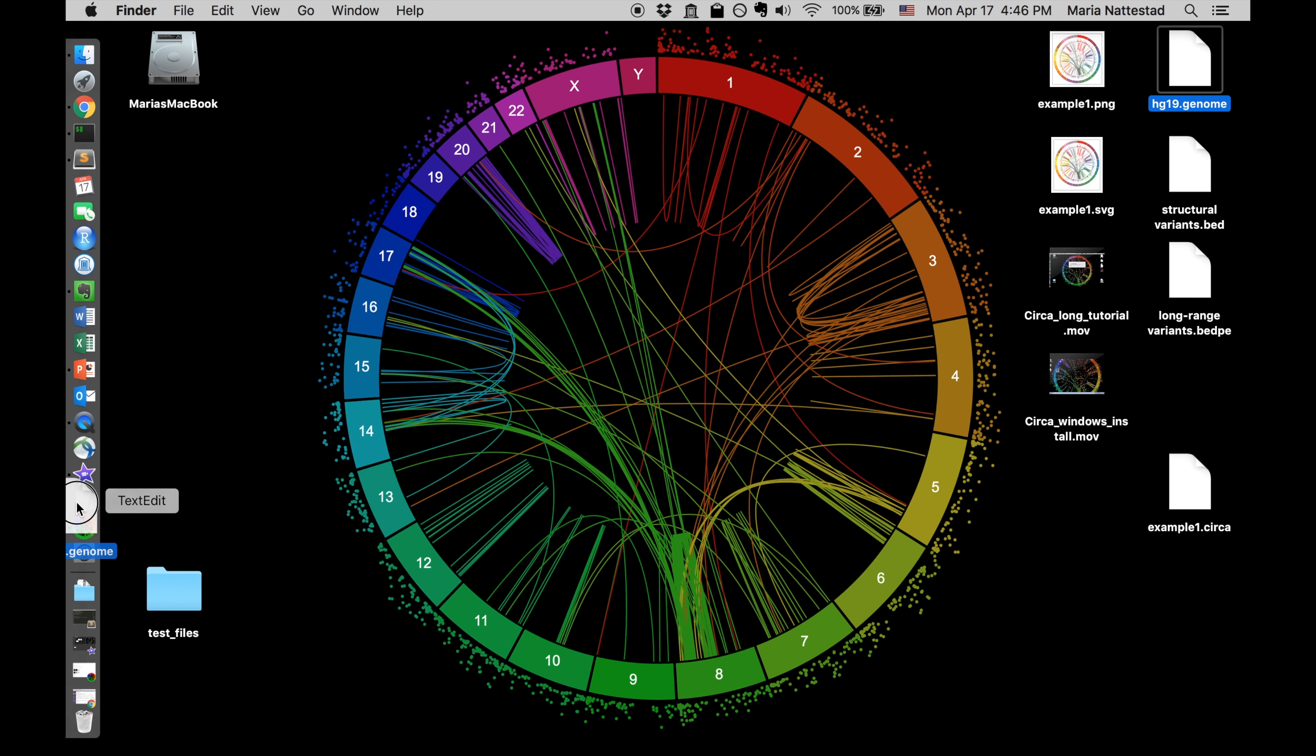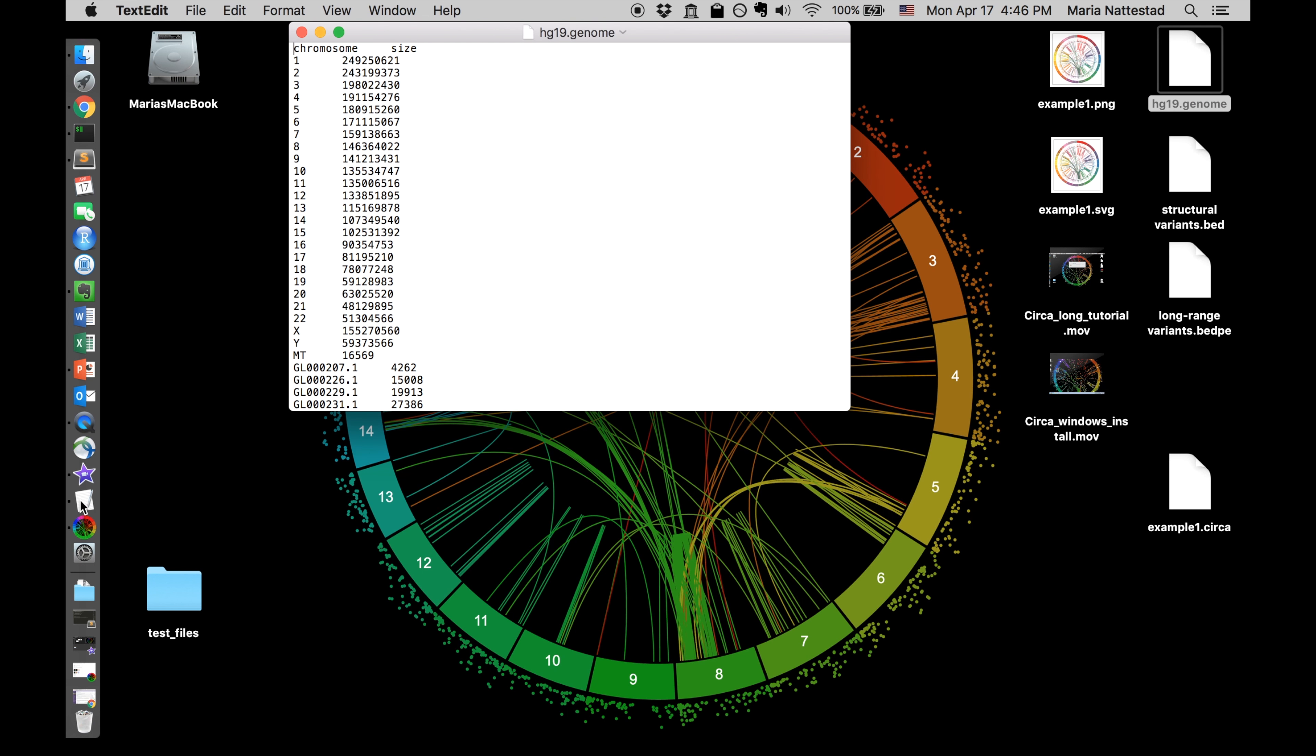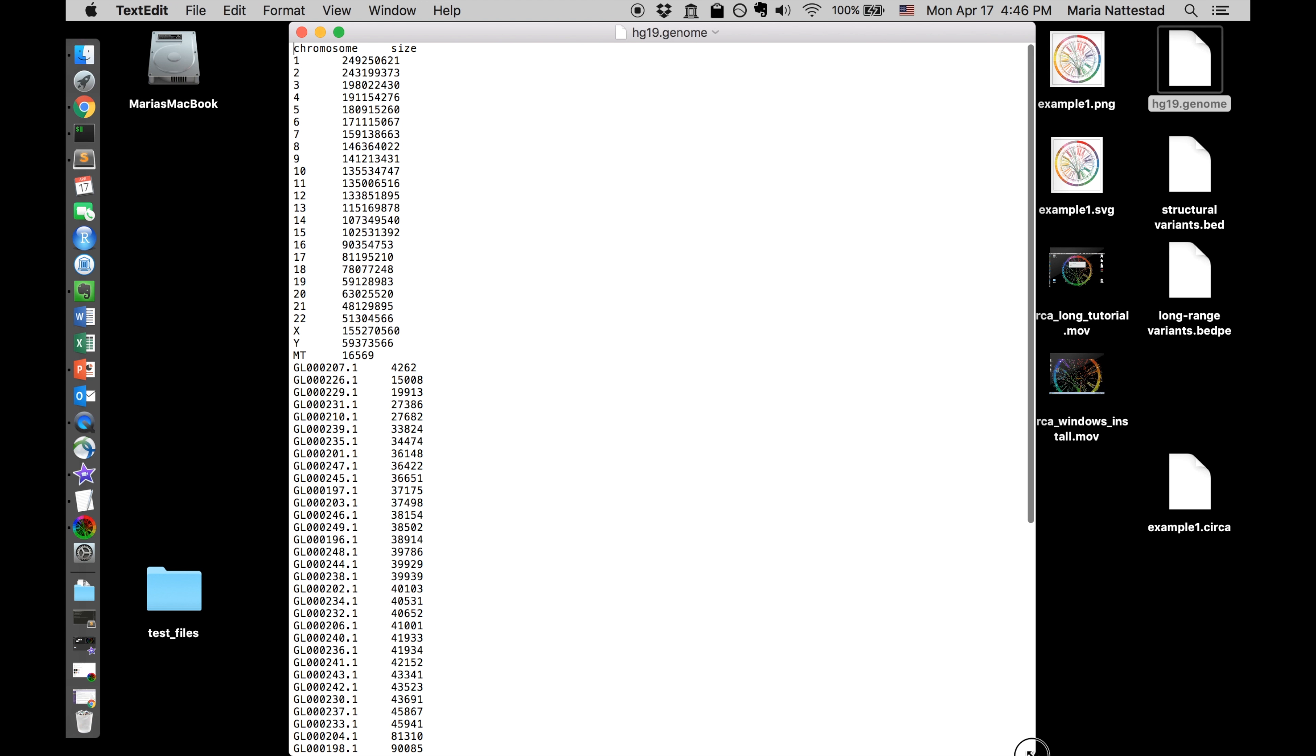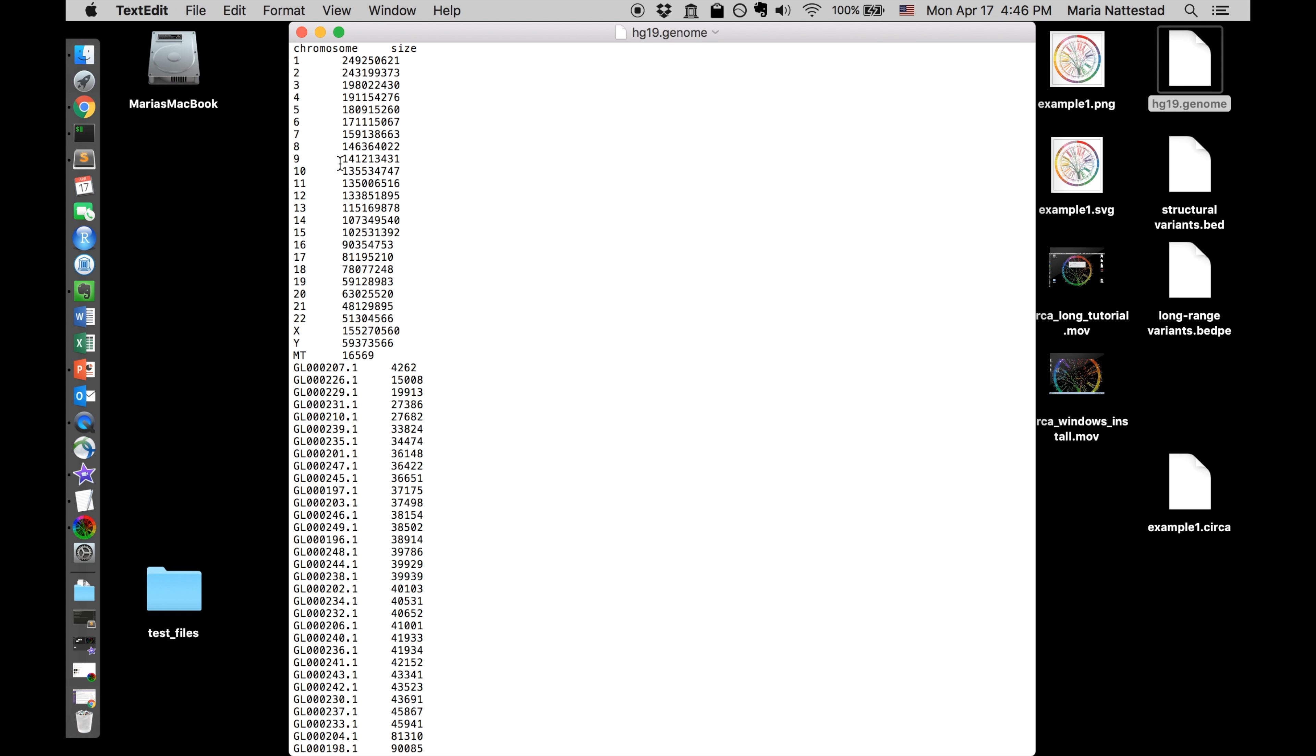I'm just going to drag one of these files in here so we can take a look. So this is a genome file. This is what you need in order to start each new CIRCA plot. This is where you have the chromosome names and the sizes of each chromosome. These right here are tab delimited, and it can also be comma delimited. It'll figure that out on its own actually. You just have to put it in there and it'll automatically parse it if possible.